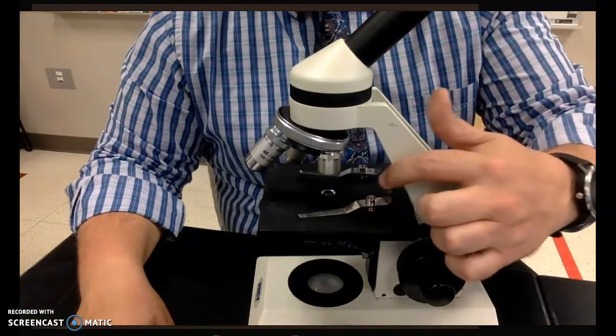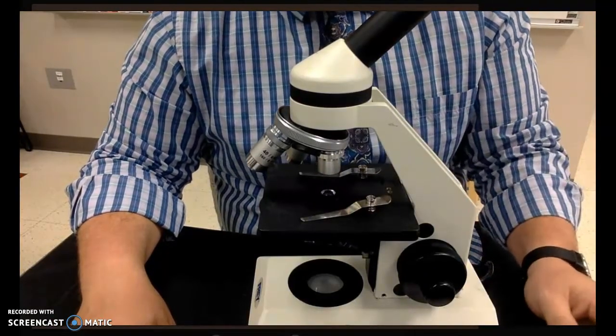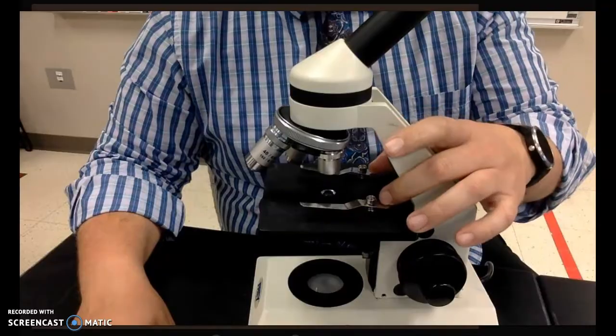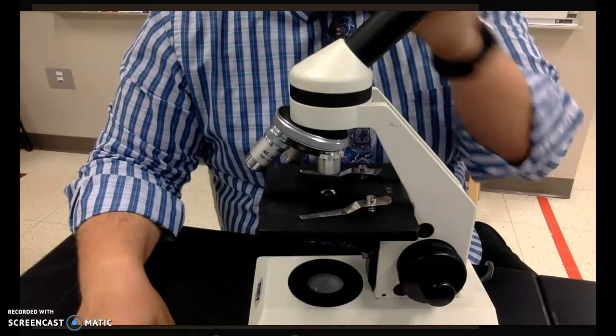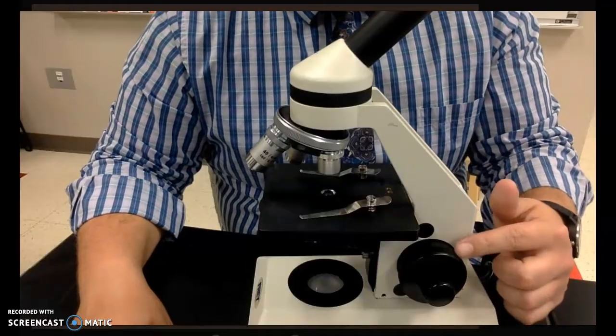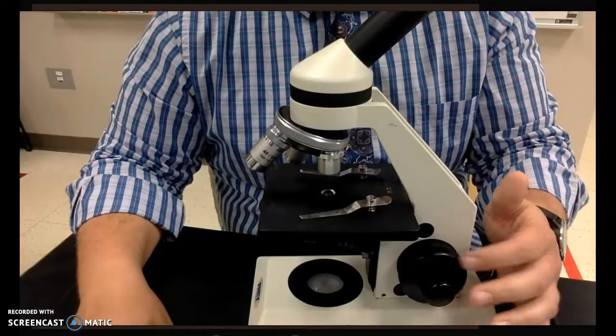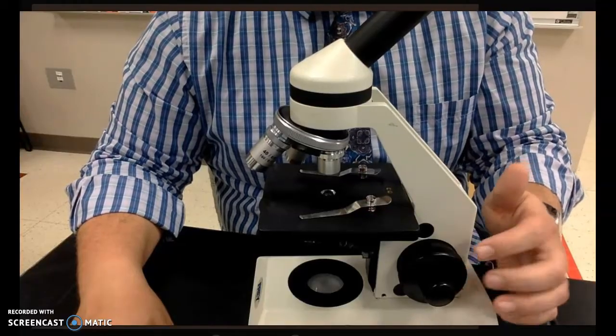On top of the stage, we have what are called the stage clips. Our microscopes have 2 stage clips designed to hold a slide in place. Moving on down, we have our focus knobs. Now, our microscopes have 2 knobs that are stacked on top of one another.